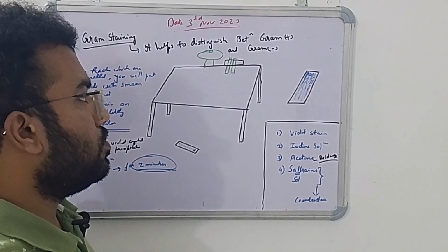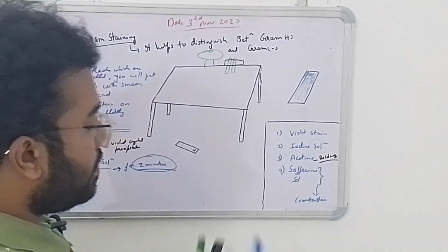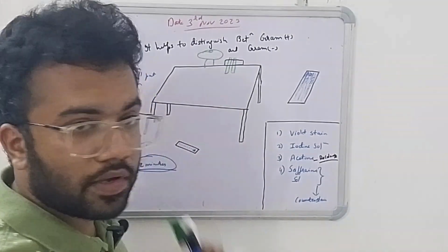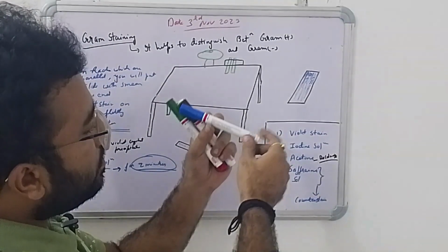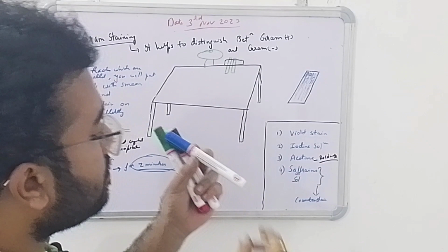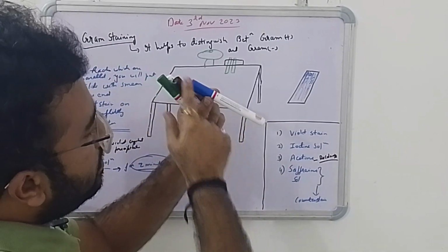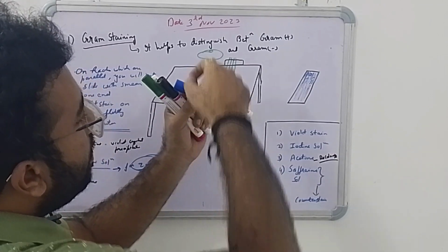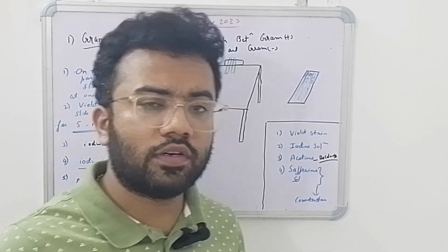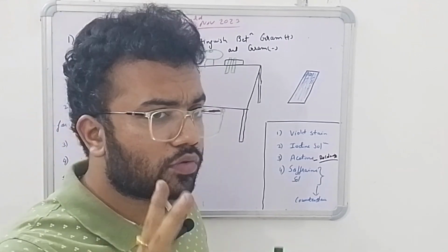For using acetone, we first have to grasp the slide with forceps again and make an angle like we did earlier for the iodine. So again, grasp the slide at the end where the smear is not present. For example, you are using this end. Just imagine this slide. Now add acetone for 2 to 3 seconds.